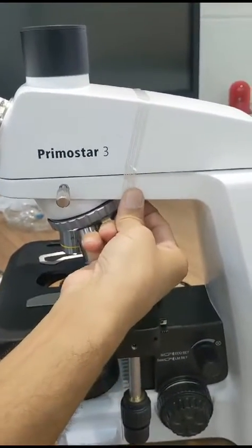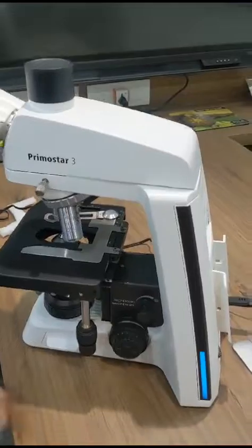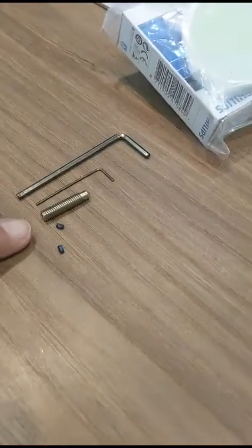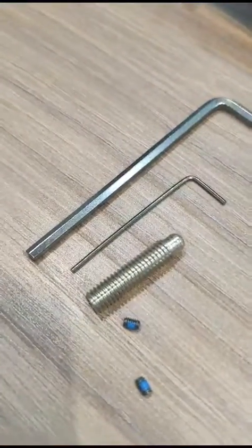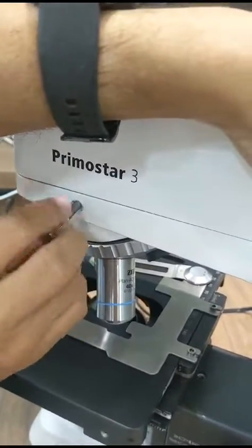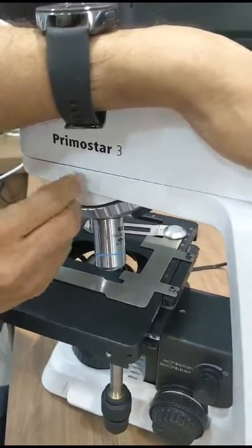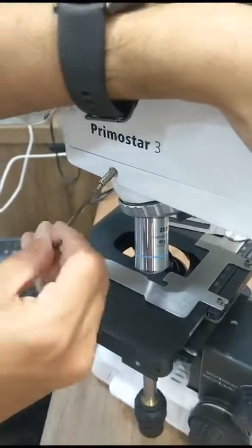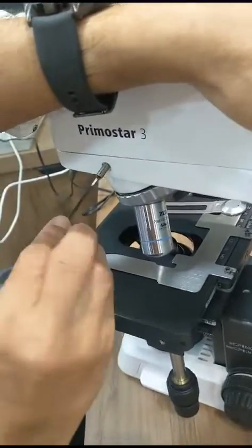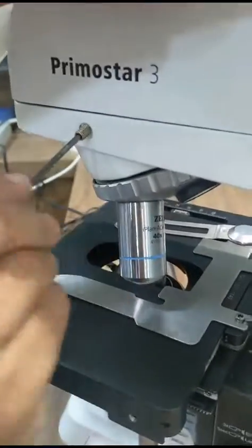We will now fix the trinocular tube. Remove the transit packing tape. We have a grub screw supplied here — this is for the stability of the trinocular tube. Remove the knurl screw and put the grub screw in its place so that you get stability and there is no accidental removal. Turn it until it locks.